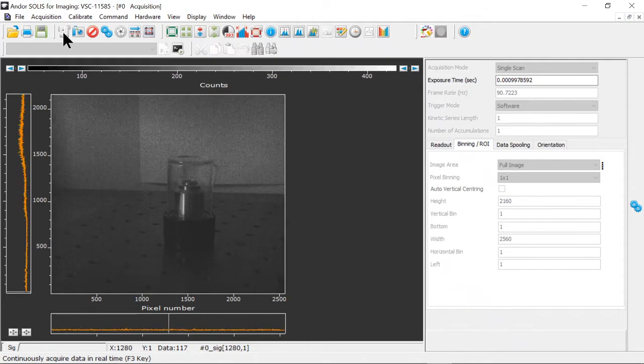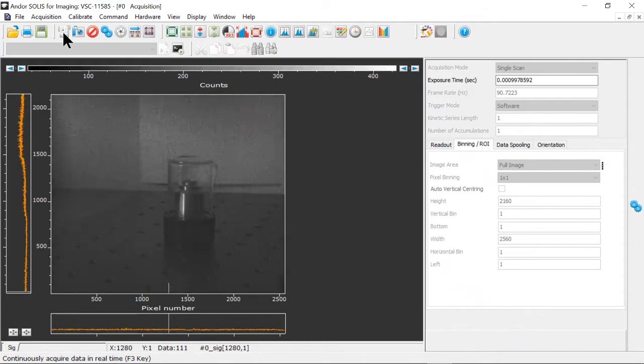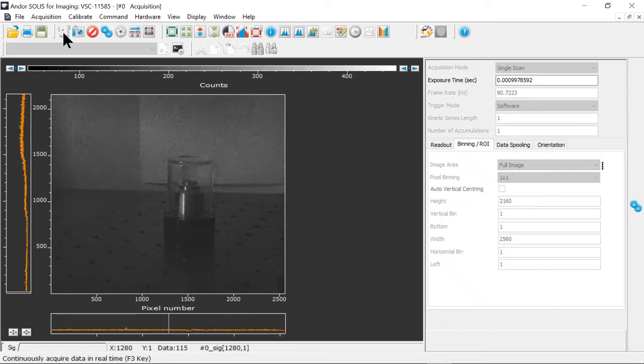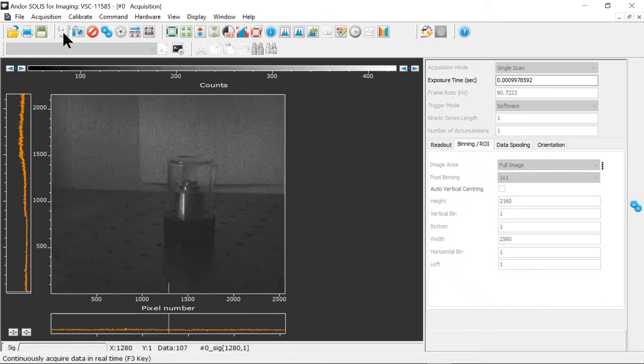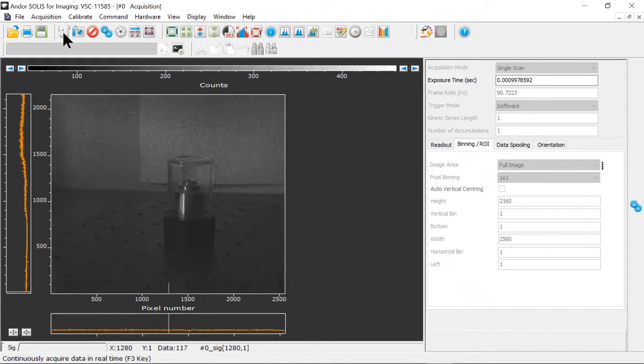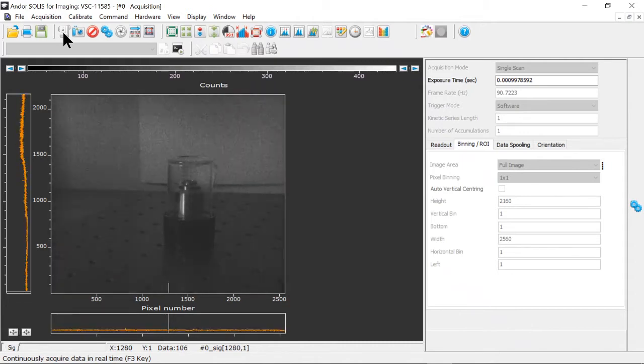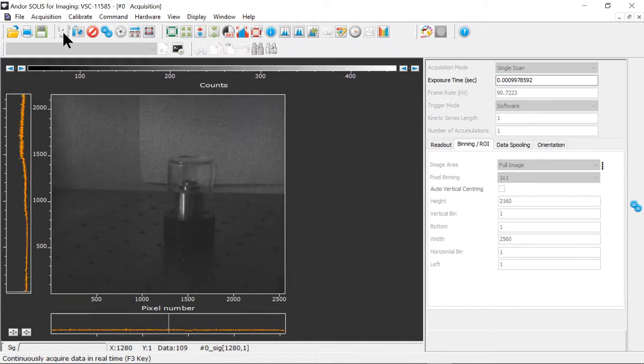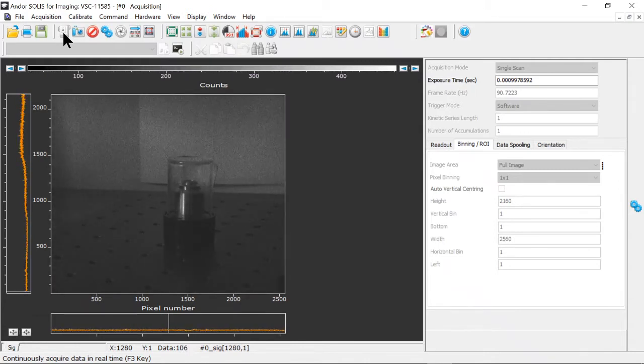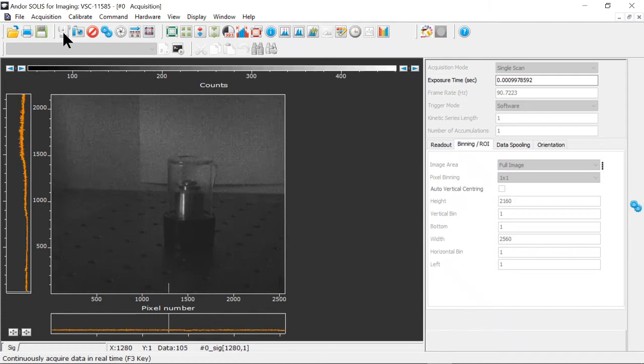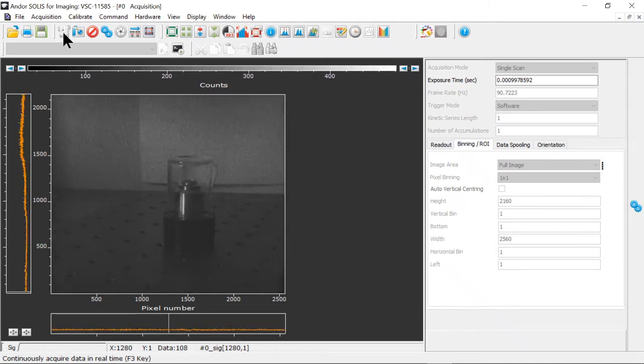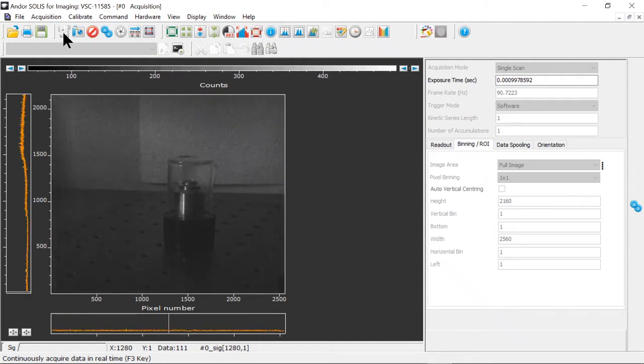The default measurement mode in Solus is Single Scan, which reads a single image from the camera sensor. We also have Accumulate, which adds together multiple individual images from the sensor to create a single final image with more signal. This can be useful in many circumstances. For example, adding together multiple exposures in memory lets you get around the maximum number of counts a single camera pixel can collect, effectively increasing the dynamic range of the measurement. However, it also involves multiple sensor readouts, each with their own associated readout noise.